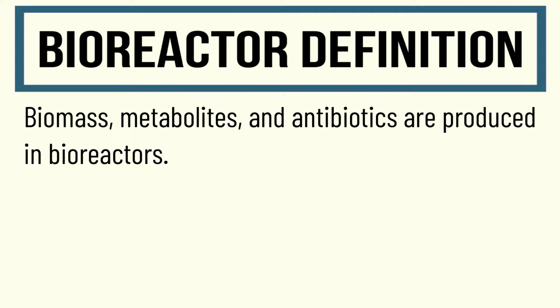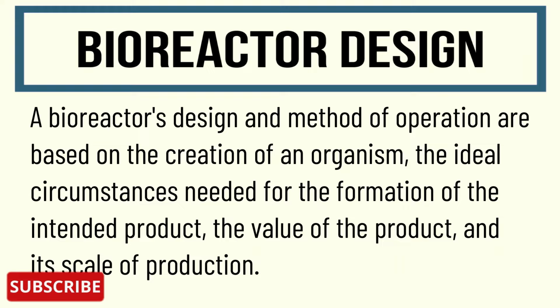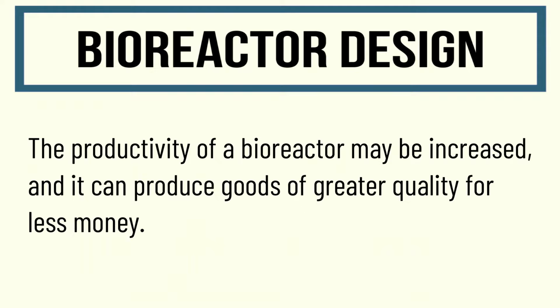So let's understand the design of bioreactors. A bioreactor's design and method of operation are based on the organism, the ideal circumstances needed for the formation of the intended product, the value of the product and its scales of production. The productivity of a bioreactor may be increased and it can produce goods of greater quality for less money.